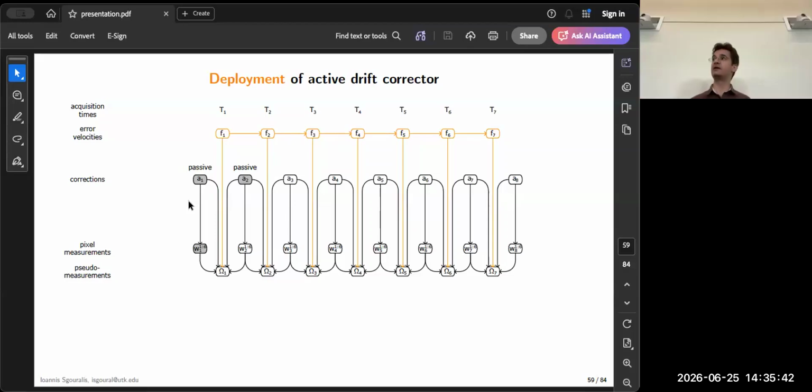So let's say we try to collect the second frame also without applying any correction. So alpha equals 0. Now, once we have made the second choice, we acquire the second frame, and once we acquire the second frame, we can compute the first omega. Because we have two frames, we register them with each other, we can get an estimate of what is the displacement happening between them. Once we have the first omega, the first pseudo-observation, then we can make a good estimate about what should be our first F1 variable.